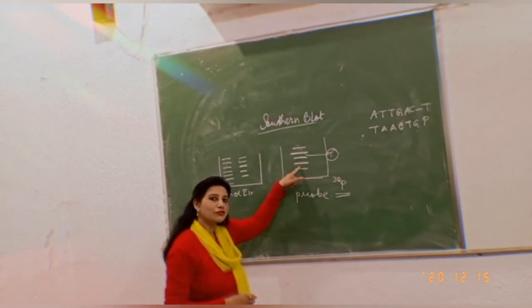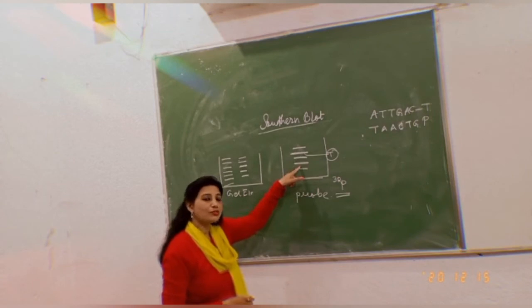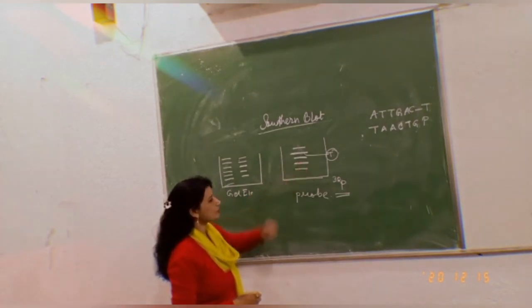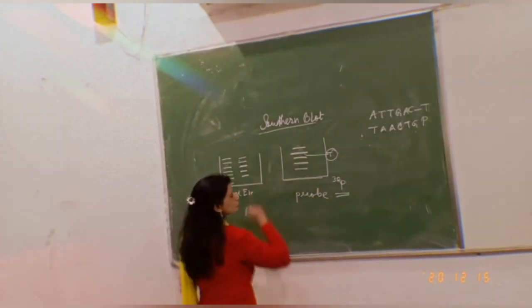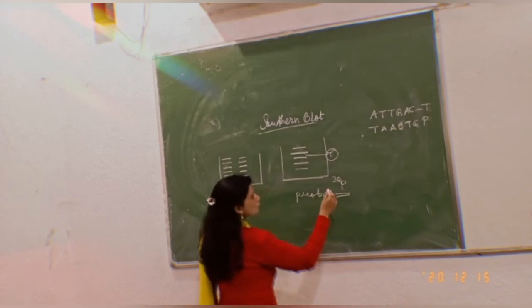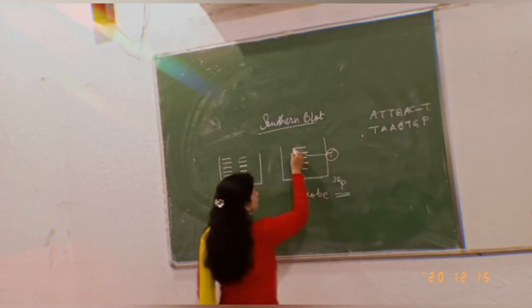Now, that means I have to again melt it. That is, the denaturation process has to take place. I will be using a denaturing buffer. So again, this buffer will be separating it, making it a single strand. And after making it a single strand, I can use my probe, which will make it a double strand.